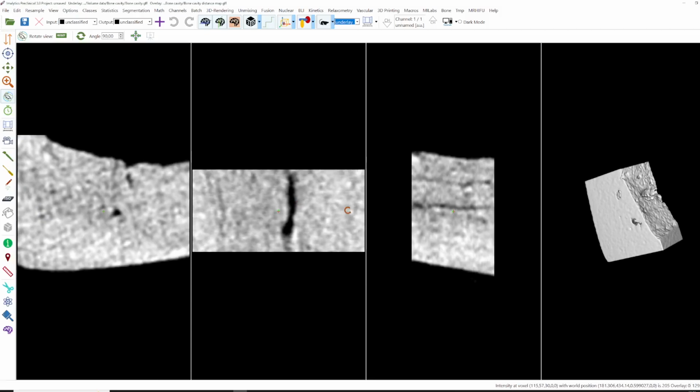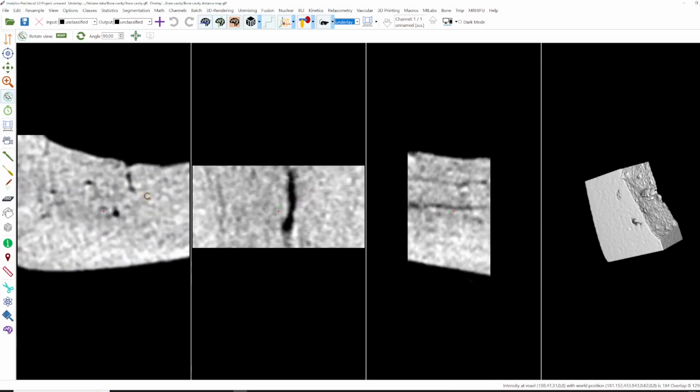What we see in the scan is a micro CT scan of a piece of cortical bone, and it has these cavities here, here and here. For example, this match shape cavity. In this video I'm going to explain how to skeletonize this cavity and compute the cross-sectional area orthogonal to the path, and also the largest fitting sphere inside as a statistic readout.